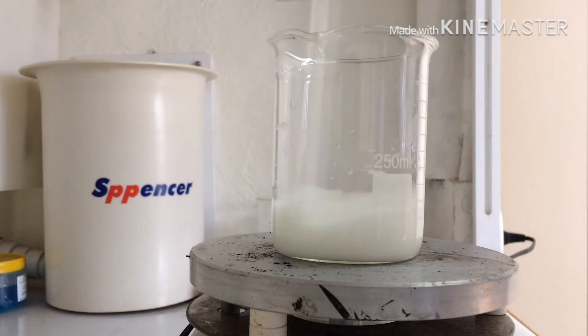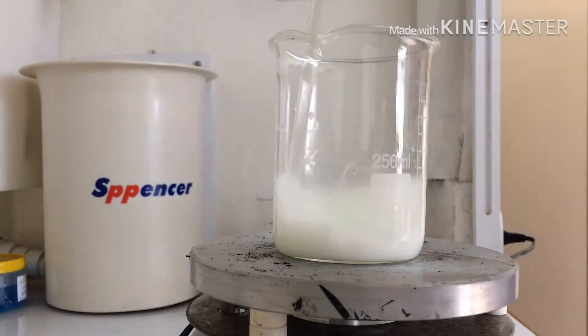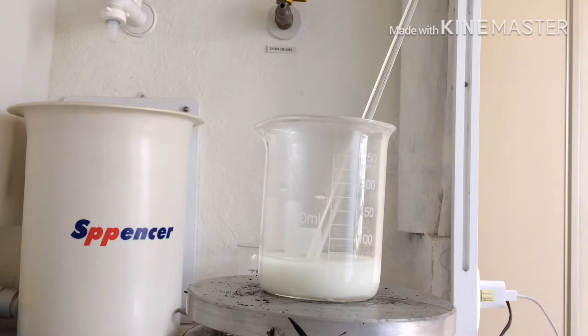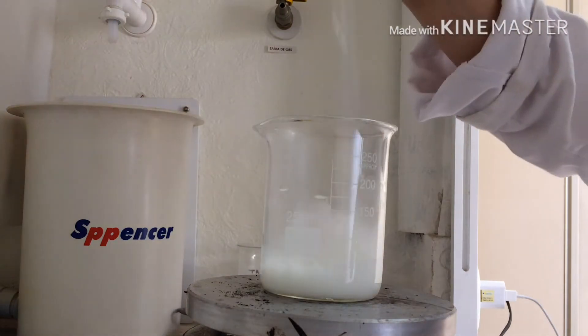And now turn on the heating plate until 70 degrees Celsius. You need to wait until it has a dense consistency. It takes about 30 to 45 minutes until it's all ready.